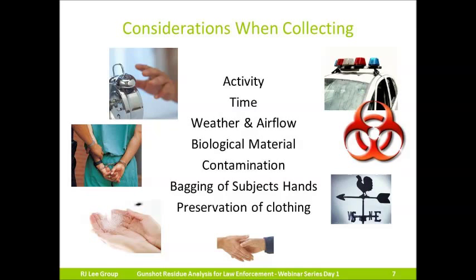Now I'm going to go over some considerations when choosing what to actually sample and collect. There are many things to consider when collecting samples for gunshot residue. There are certain factors which can contribute to particle loss. These factors can play a role in whether or not samples will have probative value for analysis.